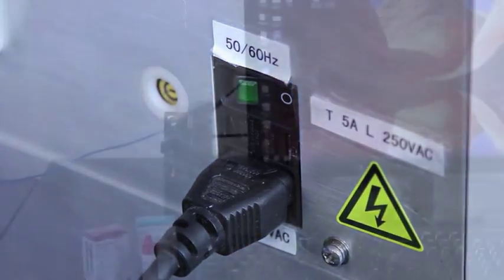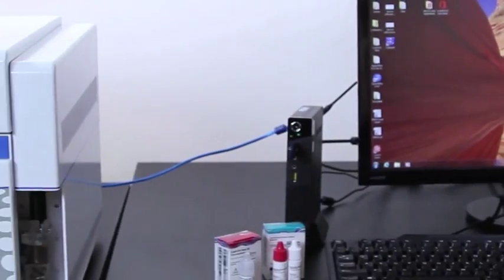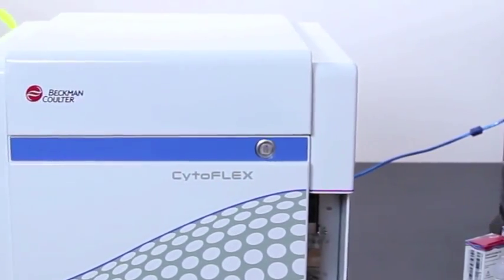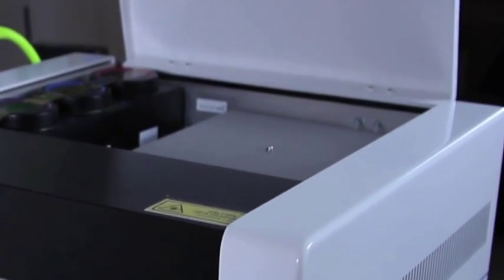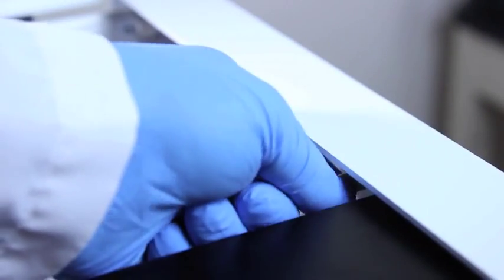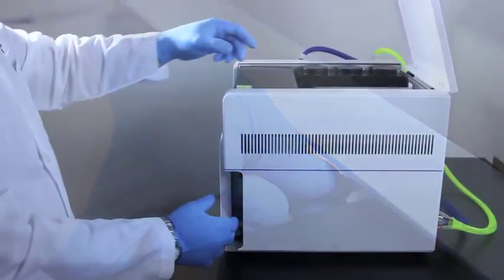Once every six months, Beckman-Coulter recommends that you replace the deep clean solution. In order to access the deep clean bottle, you must first remove the right side panel. Open the top cover of the CytoFlex flow cytometer and loosen the capture thumb screws at the top.